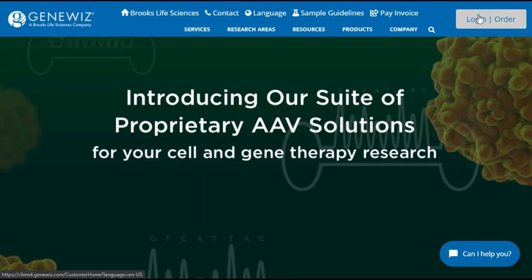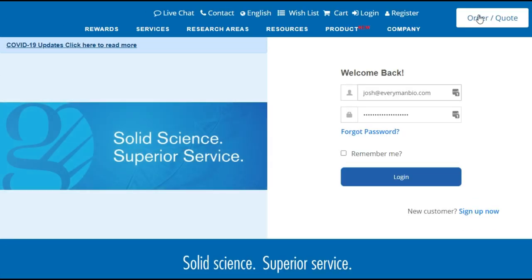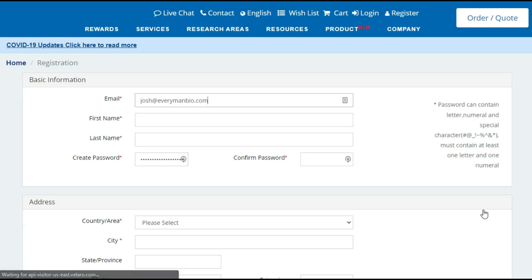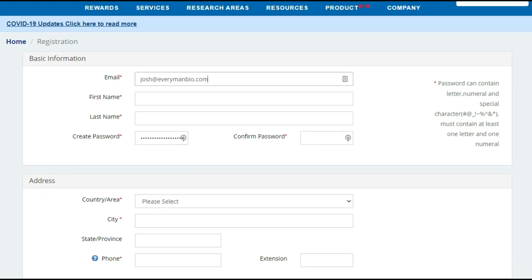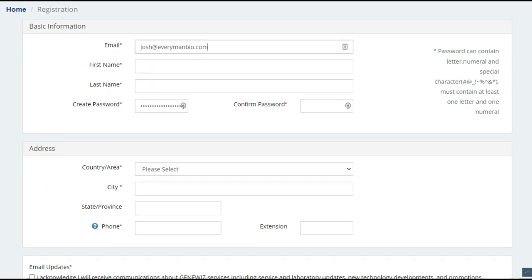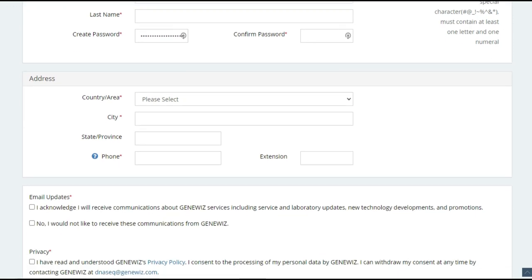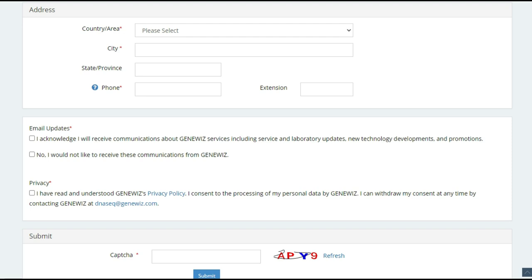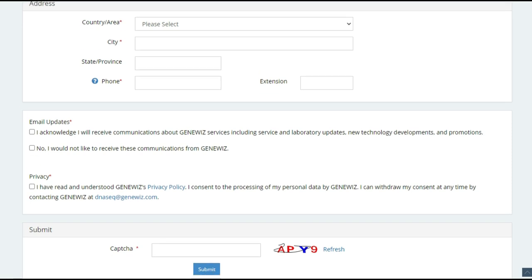So let's start by going through the process of setting up a new GeneWiz account. So you'll just click on the login and then sign up now, and there's really not a lot of information on this form. Just your typical login information, your address, and a couple of terms of service boxes that you need to select.